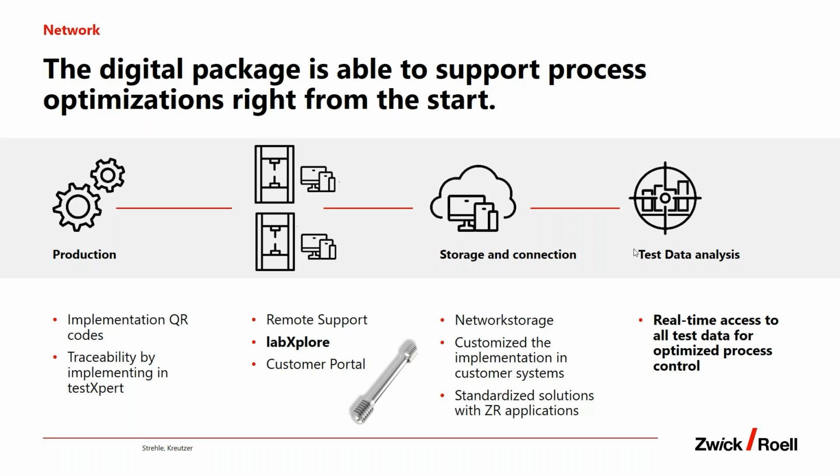Daniel already mentioned the remote support: if there's any issue with your machine, then our engineers can access your testing system remotely with your release, and we can help you at very short notice if there's any issue.